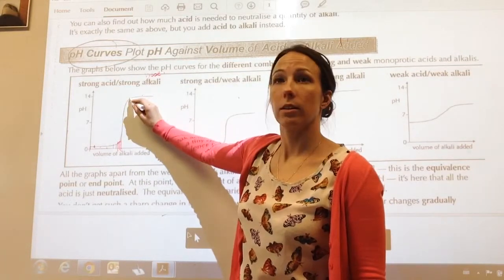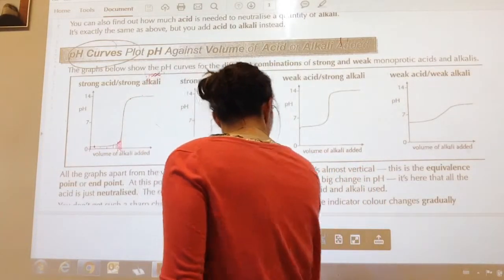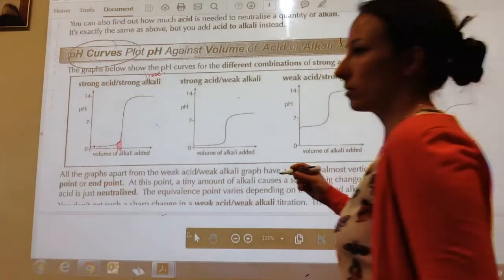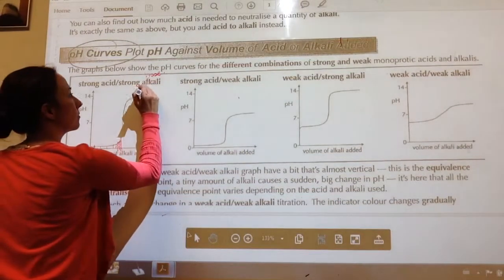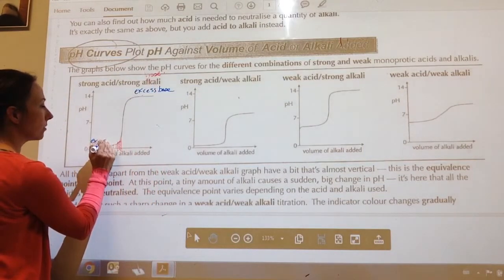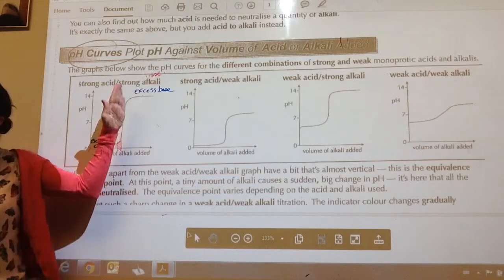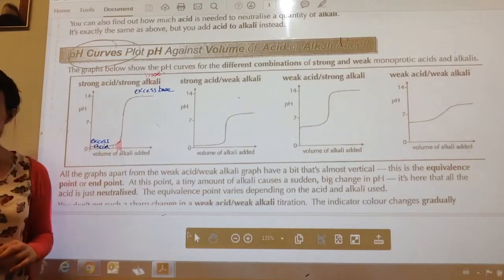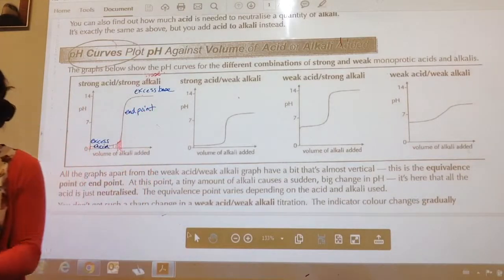So pH 14. See that? So up here I have excess base. So to get a color. Blue's better. Here I have excess acid. And this point where color change occurs, what was that called in Chem 20? That's right, an end point, because that's when we end the titration.